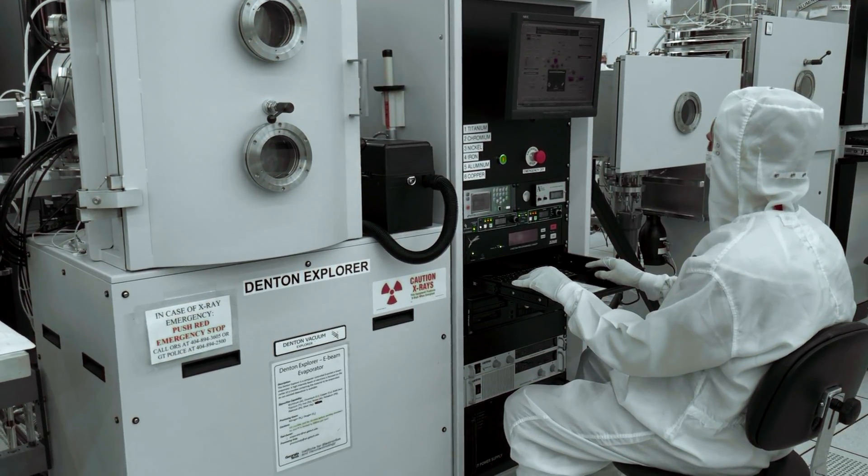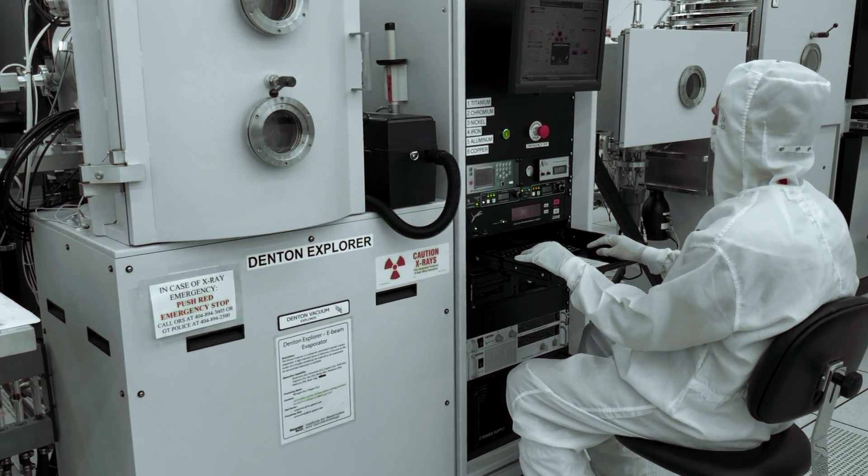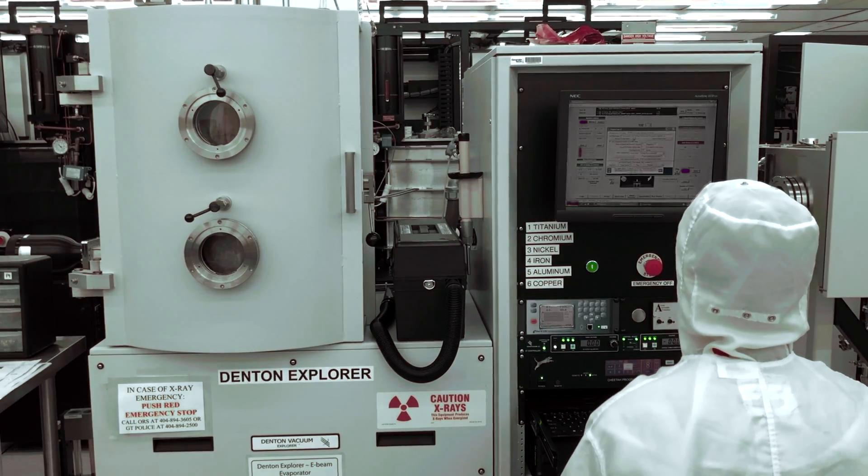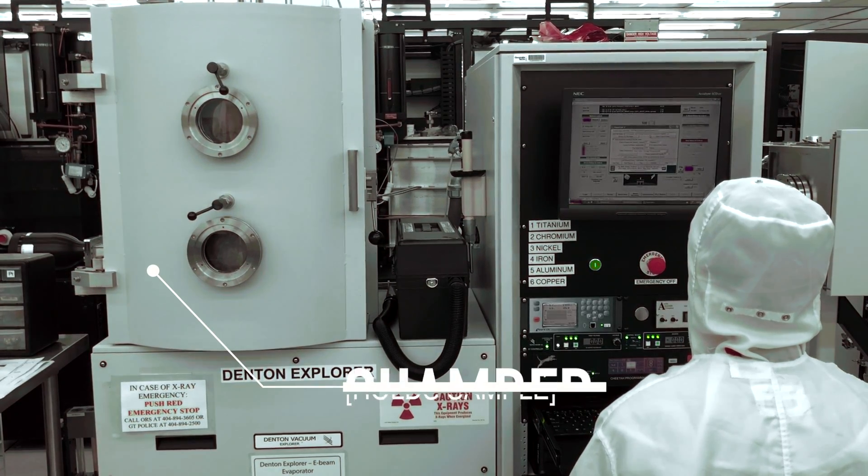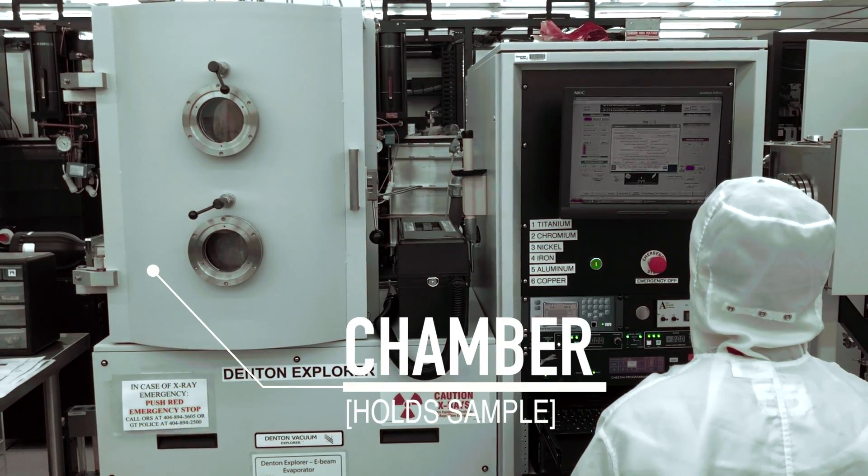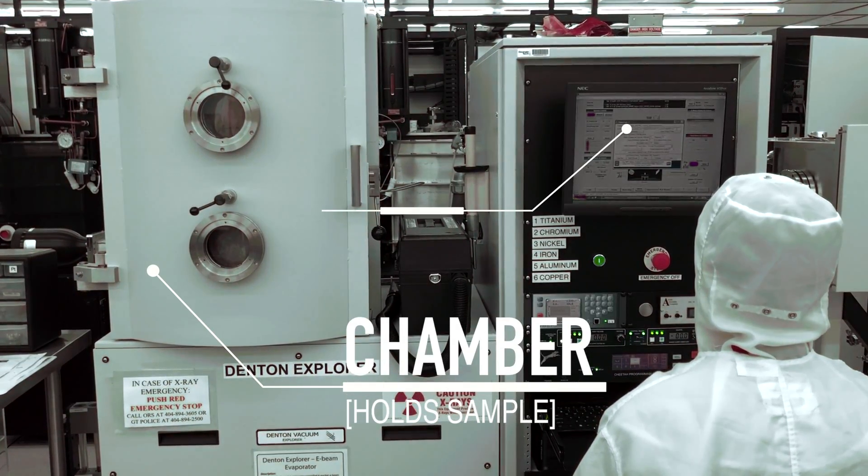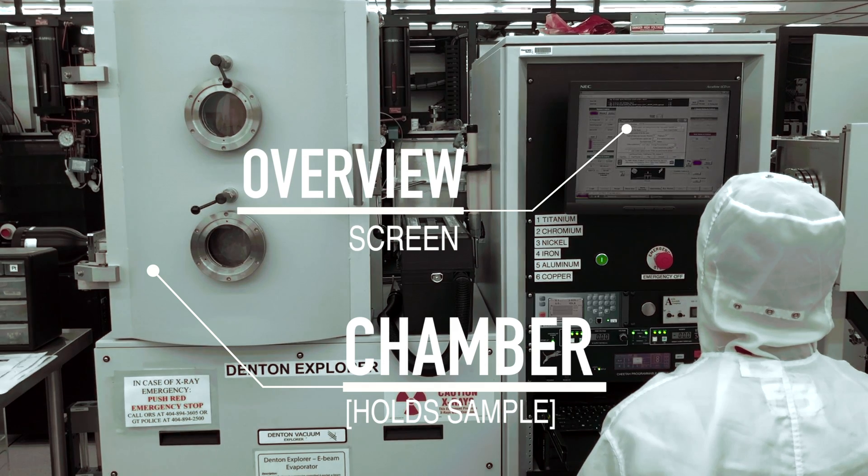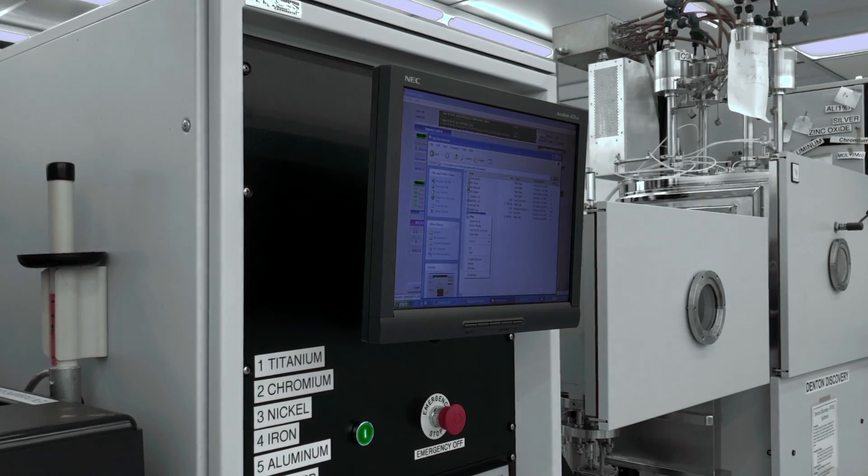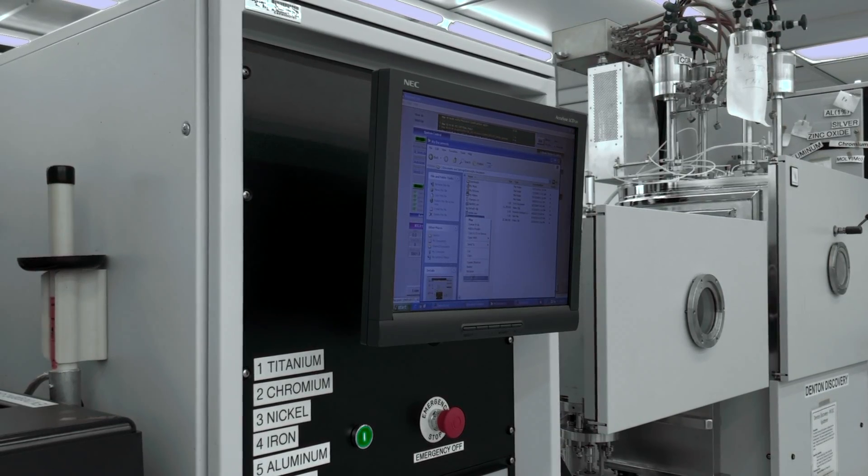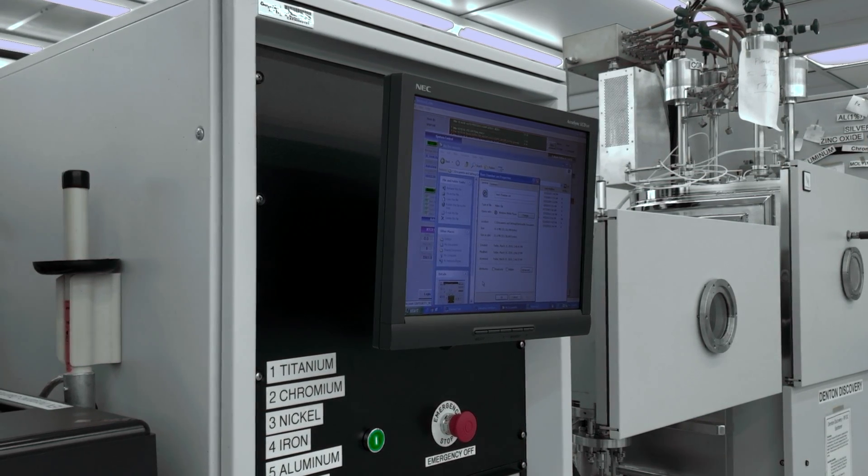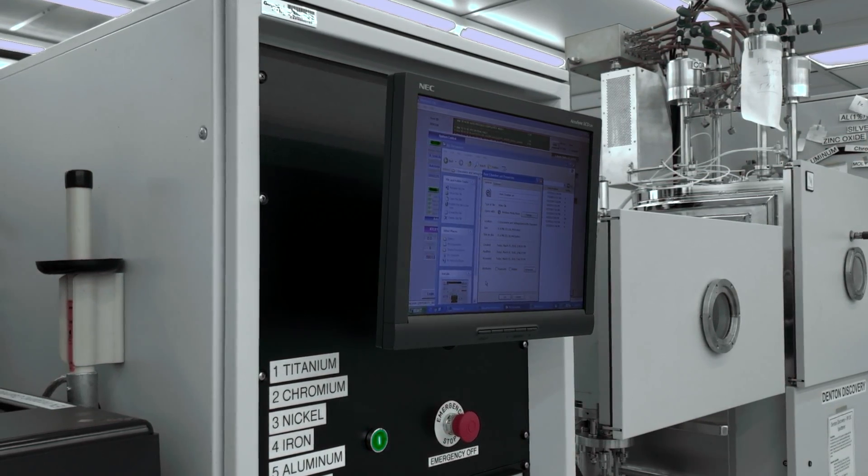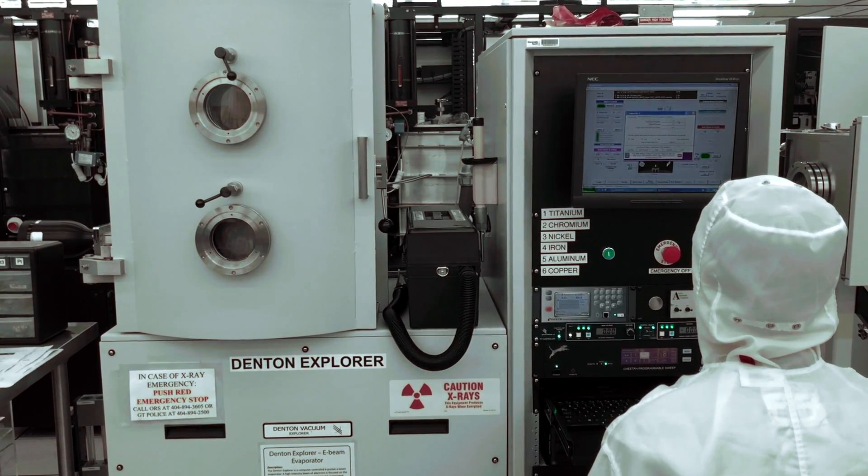Now let's go over the various parts of the Denton Explorer e-beam evaporator. The chamber holds the sample and is pumped down and sealed during a process run. The overview screen allows the user to download recipes and run a process. Most of the operations are performed on the overview screen.